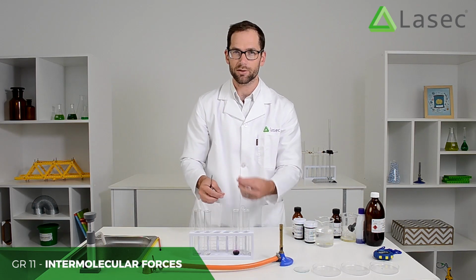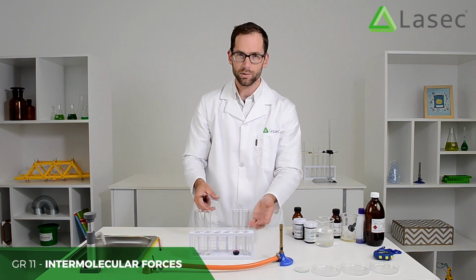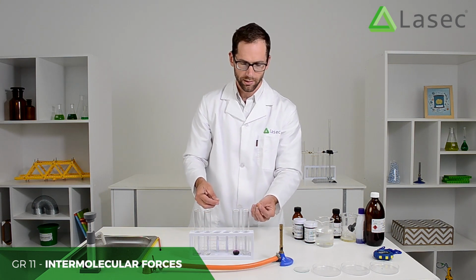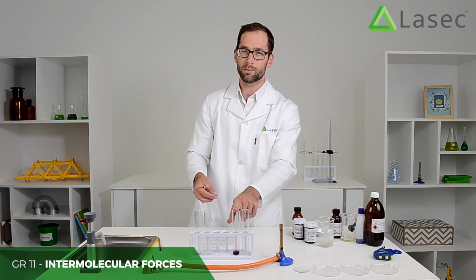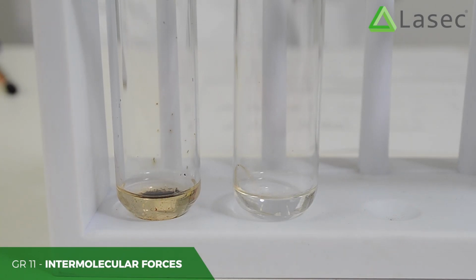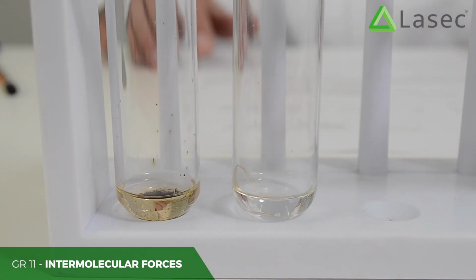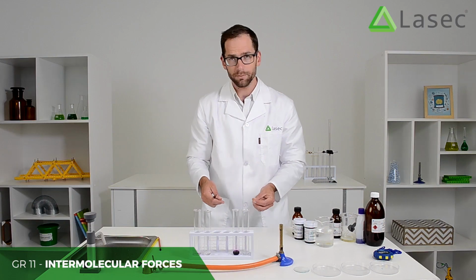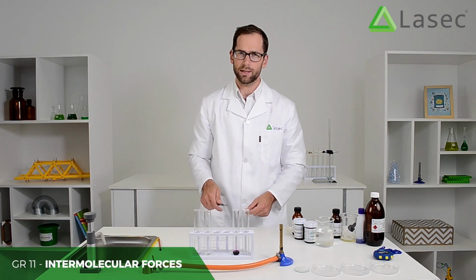Whereas with the water, as I threw the crystals in, immediately I could see them dissolving. The water became a little bit more murky. With the potassium permanganate, it became purple. And here I can see in the ethanol it's starting slowly to dissolve. See around the crystals a bit of purple color. They can time that off. It looks like it's going to take quite a while for it to dissolve, and write down their observations on that.